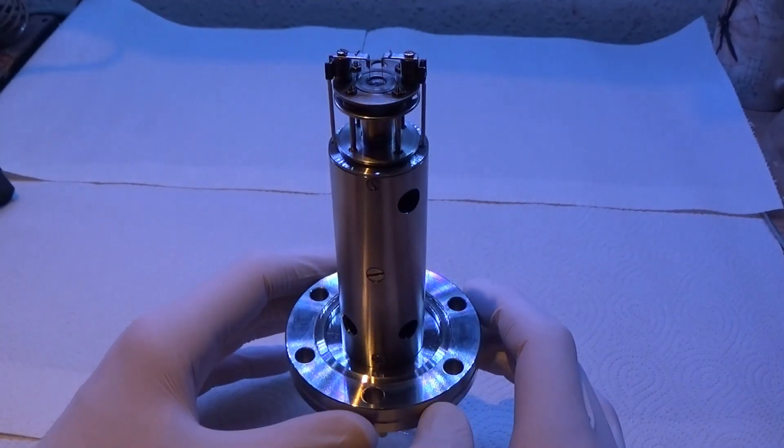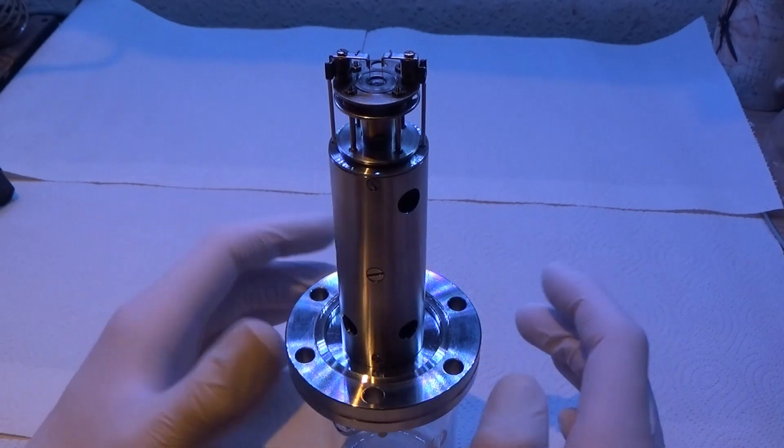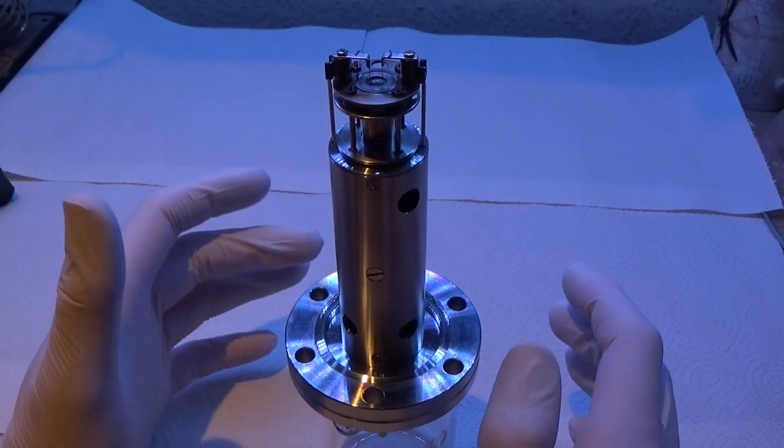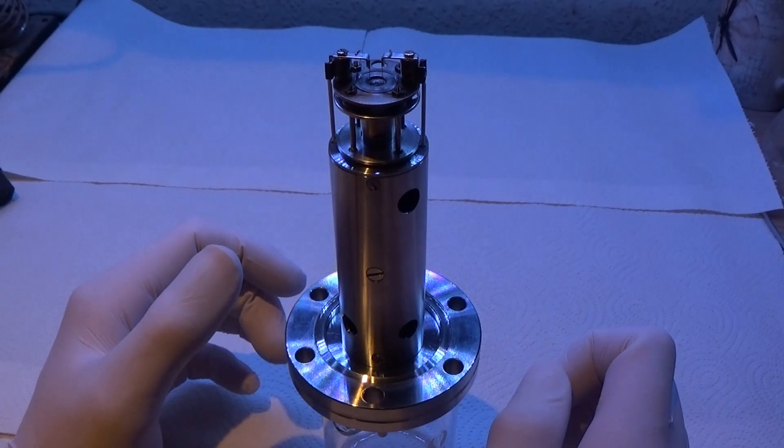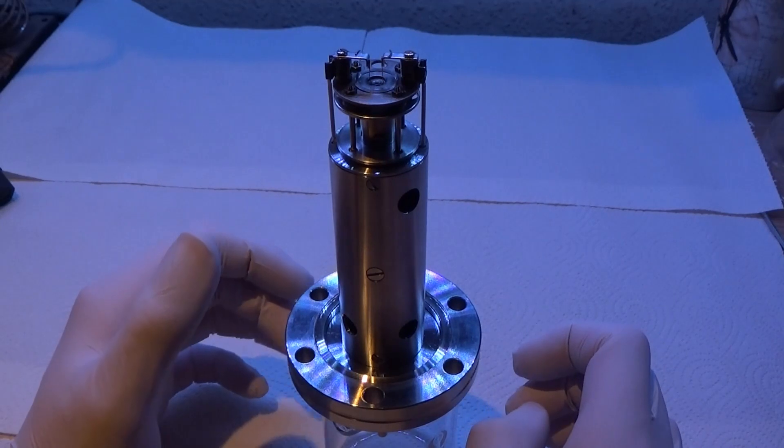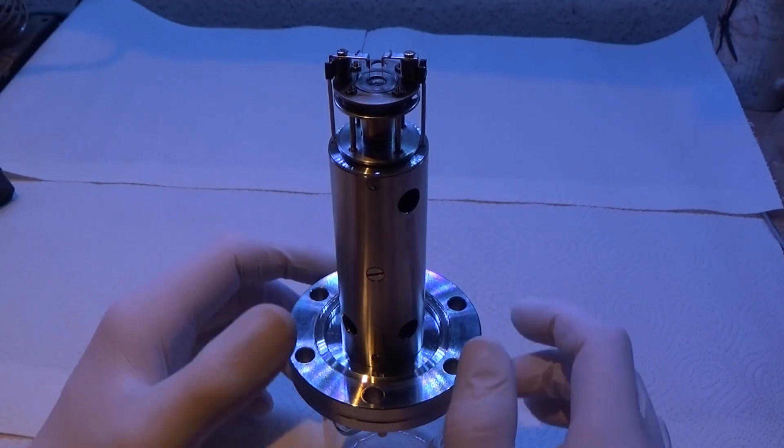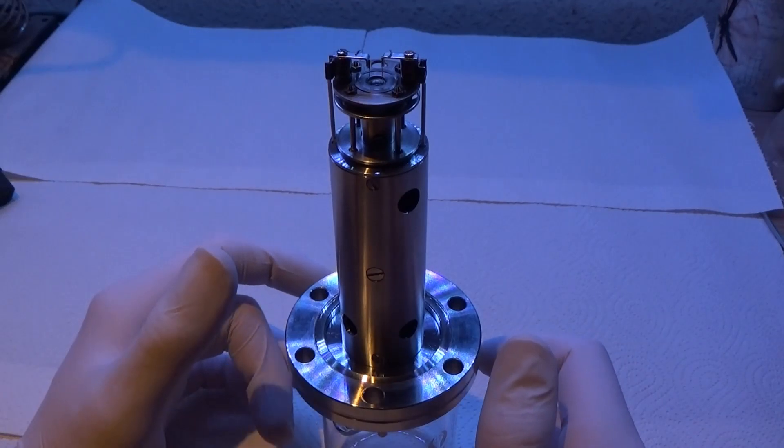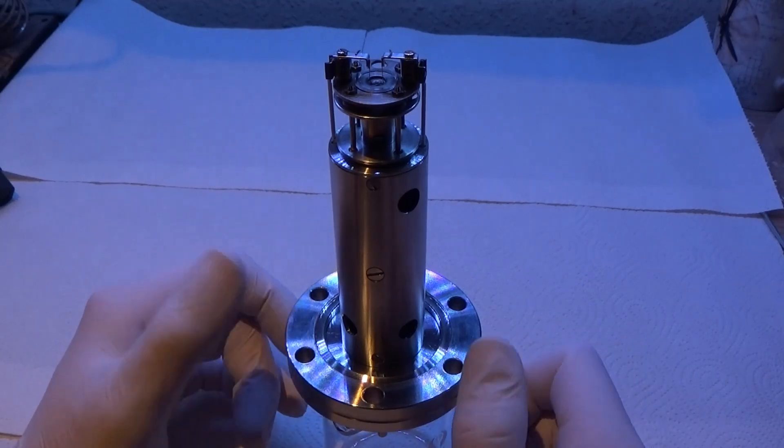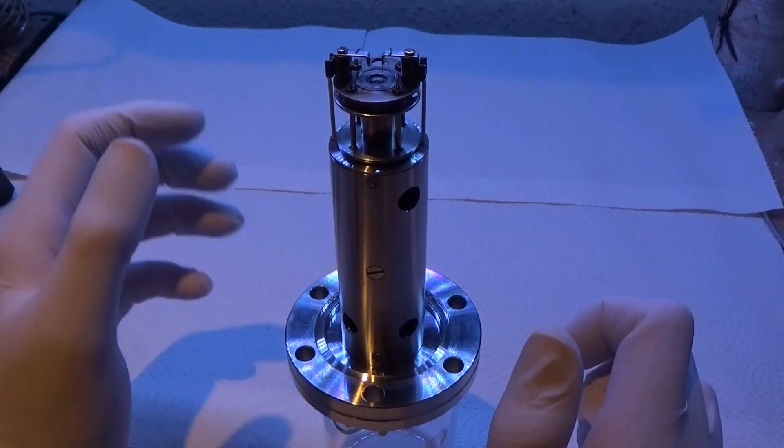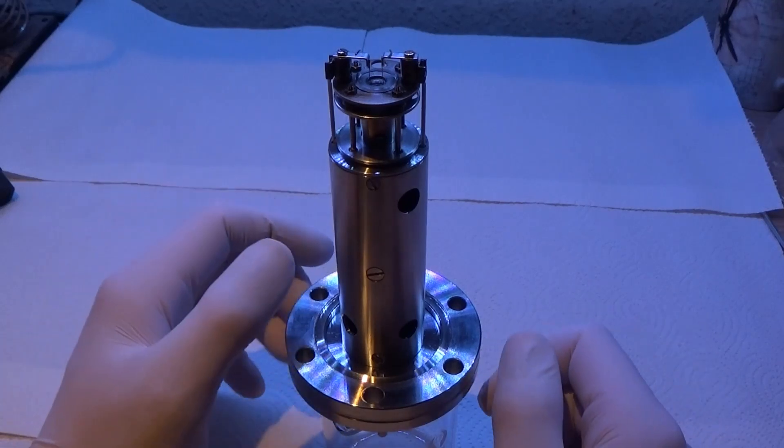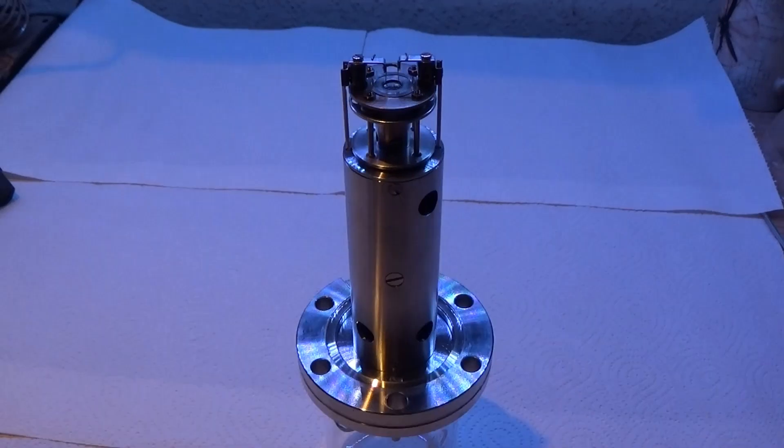When you say residual gas analysis in a vacuum system, you're basically talking about, you know, there's almost nothing left, but that nothing has to be something. And you then do mass spectrometry on whatever gases are left, and you see what kind of things they are. If you see characteristic nitrogen and oxygen in the correct proportions, then it's probably a leak to open air somewhere. If you have a very wet vacuum system, you may also see a significant amount of water. And if you see the masses of process gases when they shouldn't be there, then maybe you have a leak in some kind of mass flow controller or needle valve. So they are quite handy.